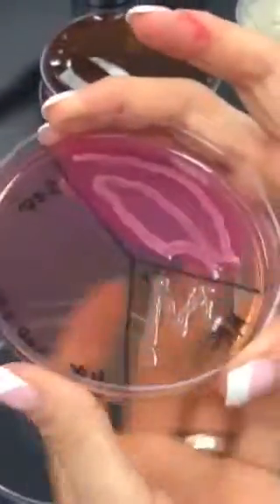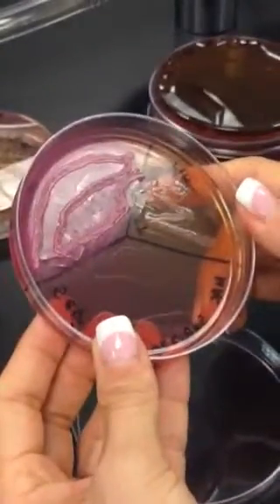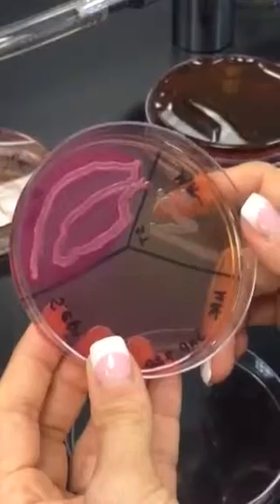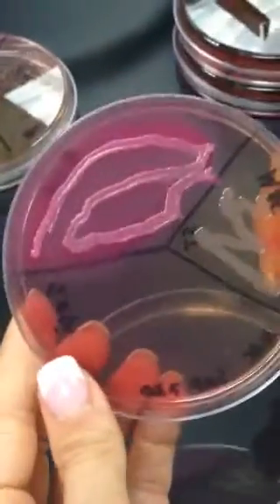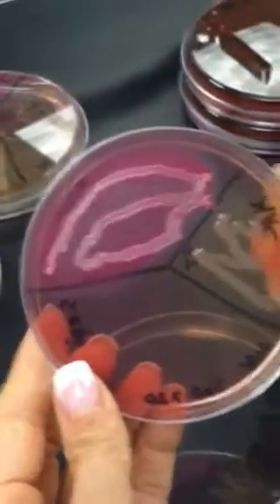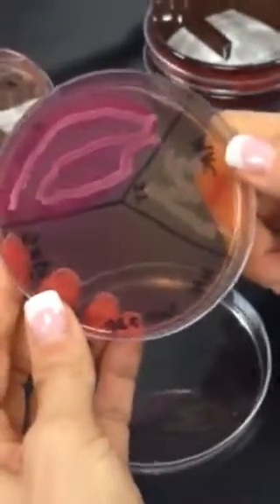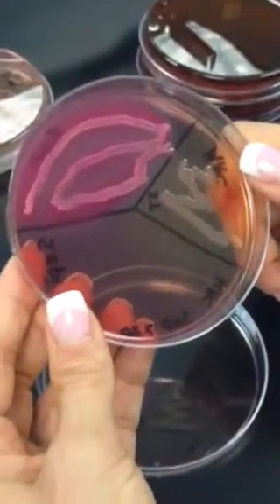So, your MacConkey agar, your E. coli should grow because it is Enterobacteriaceae, but if it's a strong lactose fermenter, you're going to get a strong color change. It'll turn milky pink because it's taking up the lactose, and when it does, it also takes up the pink dye. So the colonies themselves turn like a milky pink, like the little bunny Nestle Quik, the strawberry flavor. That's what it looks like.